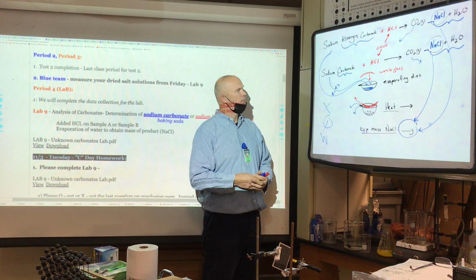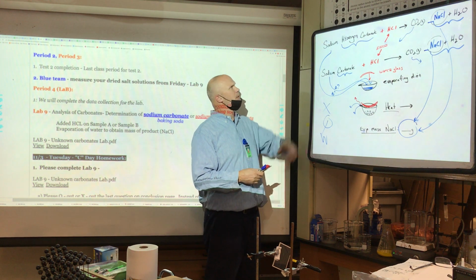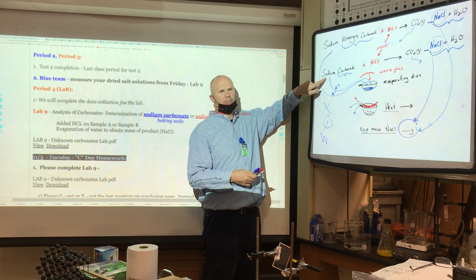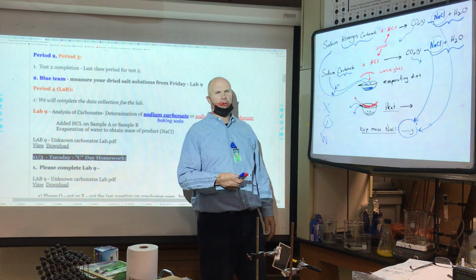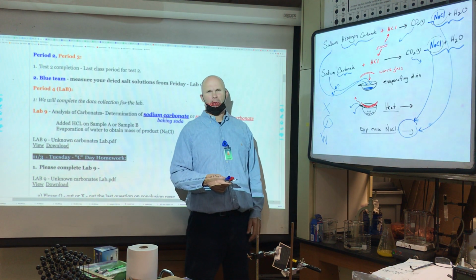Determine whether your sample is either sodium hydrogen carbonate or sodium carbonate. Identify the unknown sample as either sodium hydrogen carbonate or sodium carbonate. I kind of like my rephrased one better. But whatever works for you.